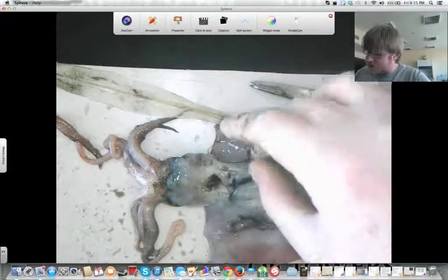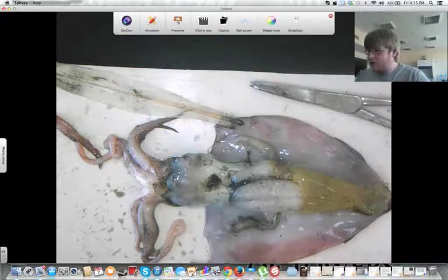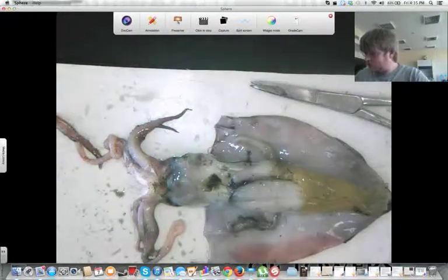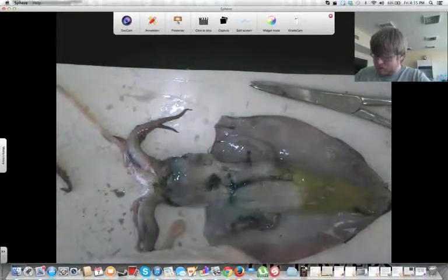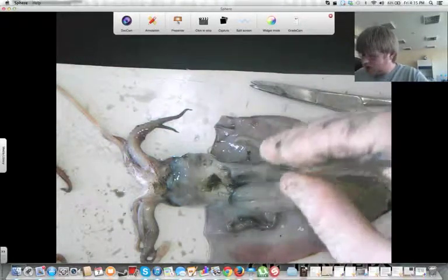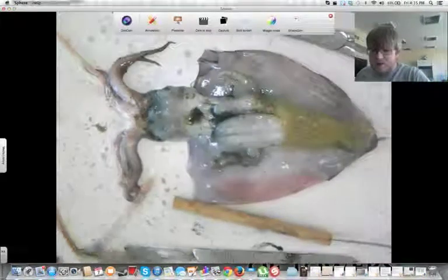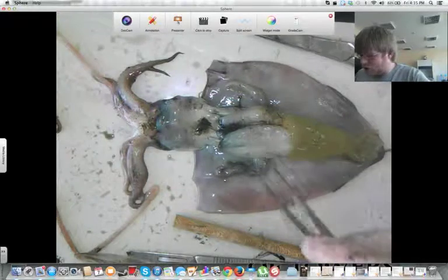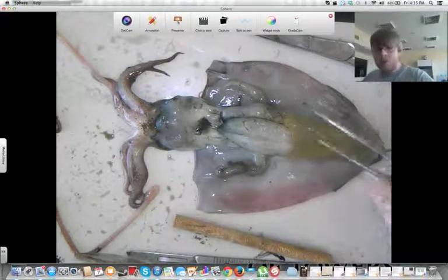Once you've opened up the squid, you can remove the pen, but then I want you to do an internal drawing of the squid. Just like when we did the external drawing, make sure you move things around so that it's easy to see everything. You should be able to see all the sections of the squid's interior very easily, and you should be able to draw them out. Again, take your time, don't rush.